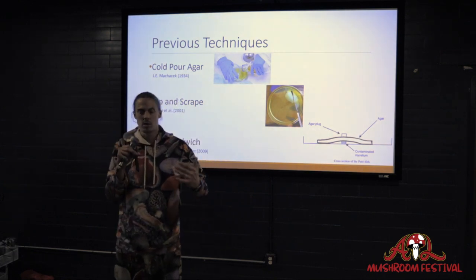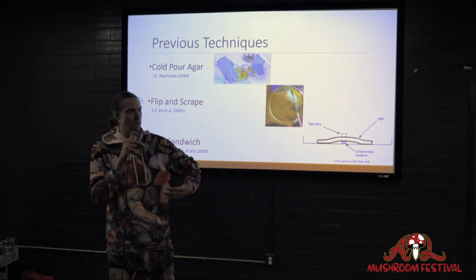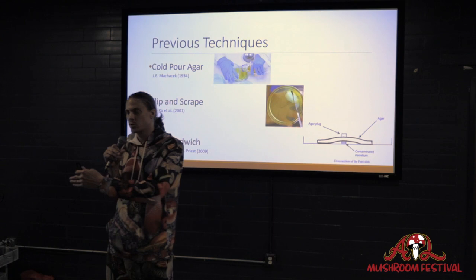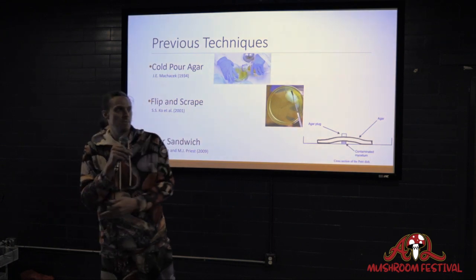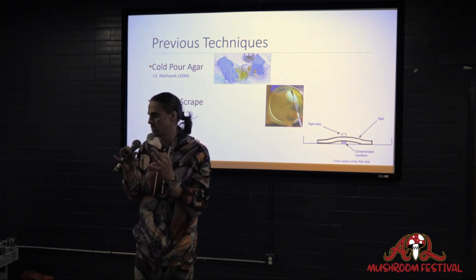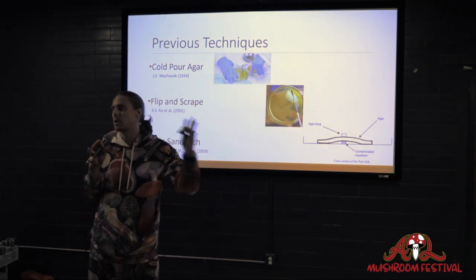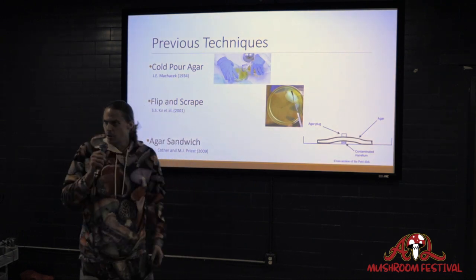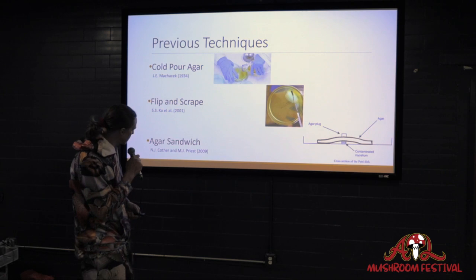And so depending upon the look of the mycelia and also the color of that mycelia and your knowledge of the culture that you're wanting to isolate, it makes it a little bit easier to gauge what you're going for and how to run away from the stuff that's not working. Yeah, hope that answers your question. Okay, perfect.